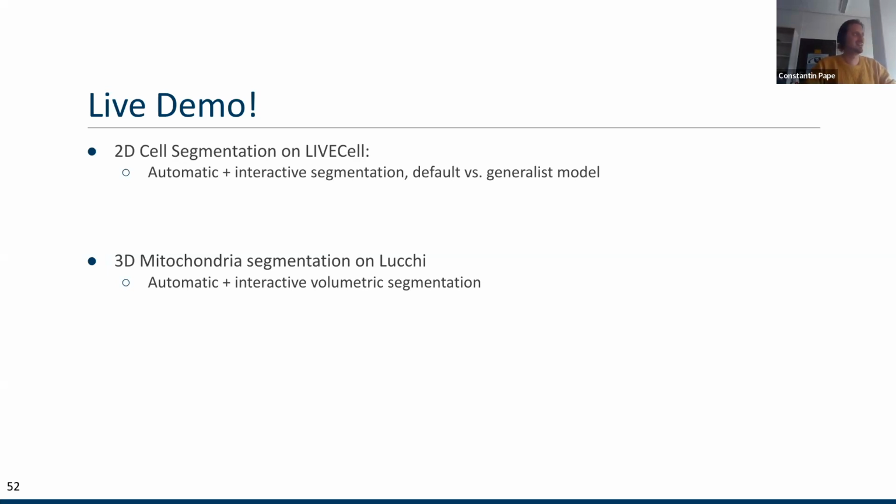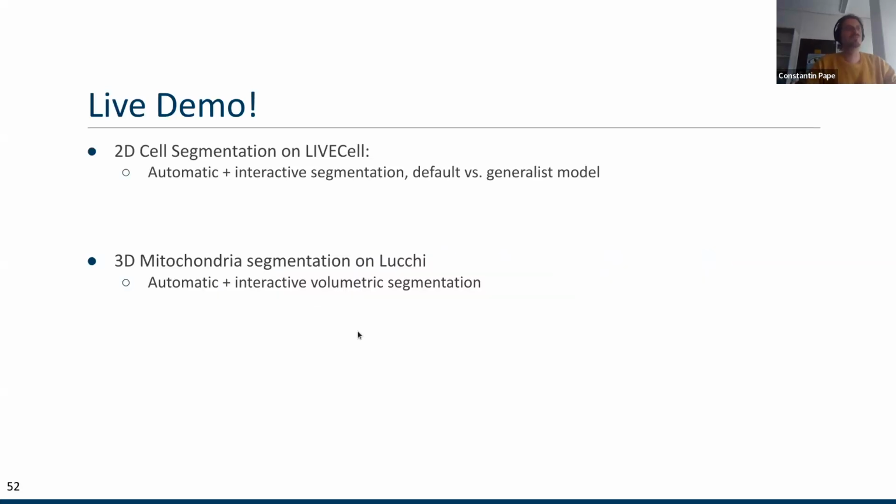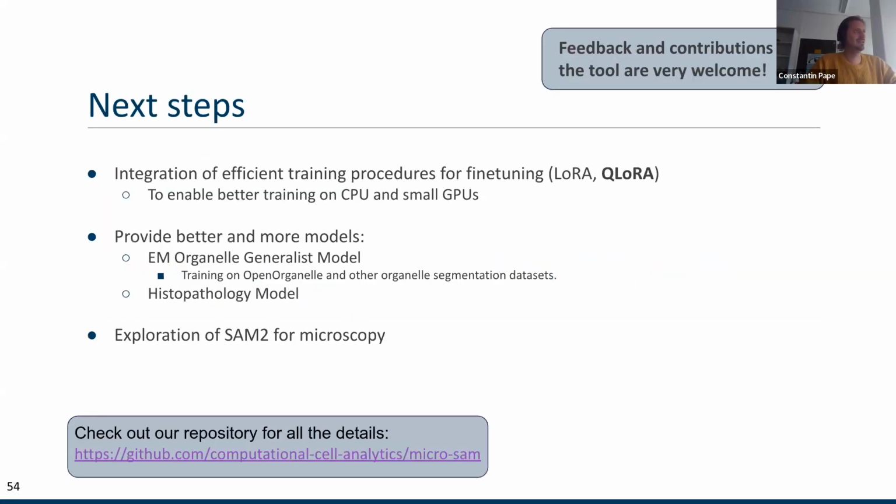It was too much CPU usage, but just to say, this would work similarly in 3D, where we can also click on objects, segment one slice, project the segmentation through the volume, and also interactively correct this. So this is really a walkthrough of our contribution, our tool as it is right now, and as you can use it.